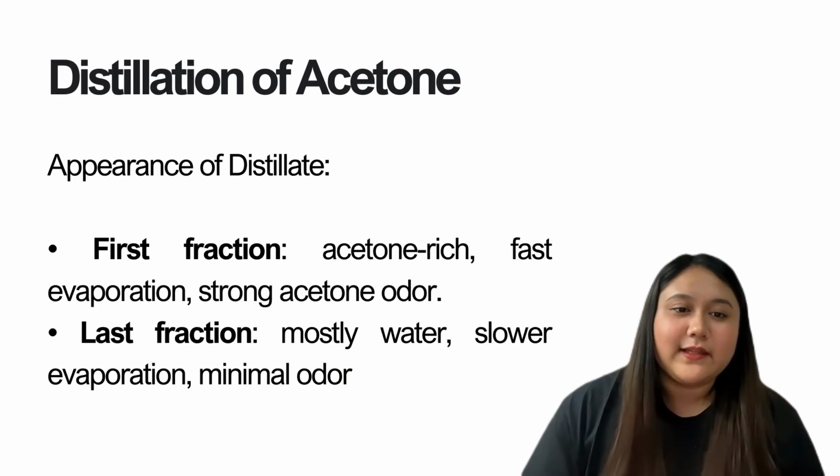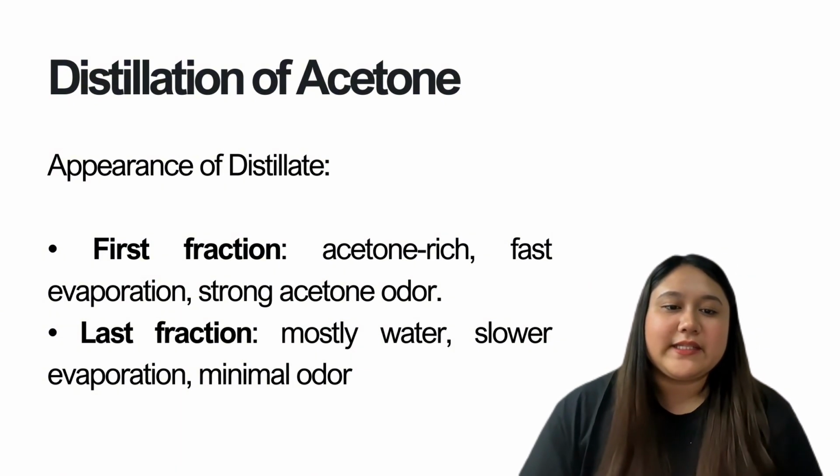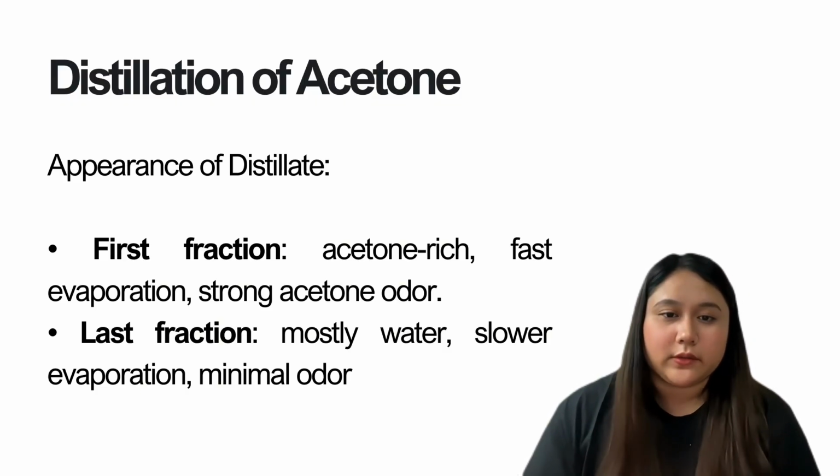Appearance of distillate. So first fraction, acetone-rich, fast evaporation and strong acetone odor. And for the last fraction, mostly water, slower evaporation, and minimal odor.